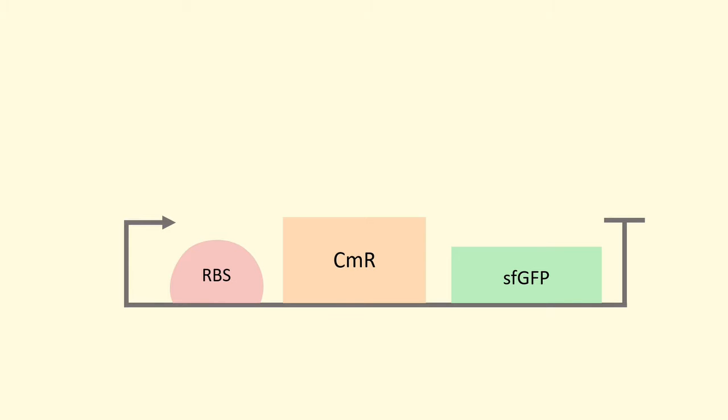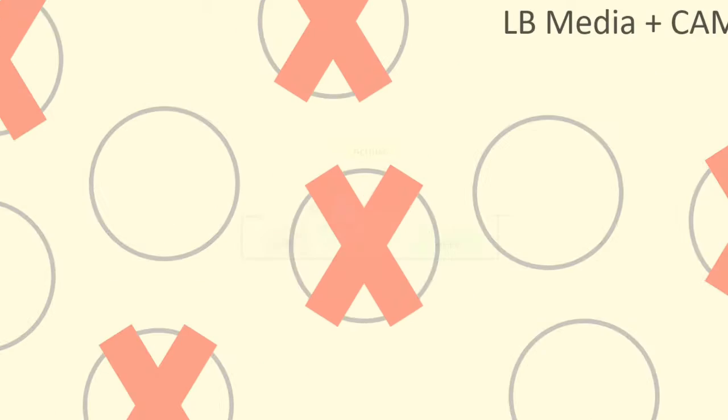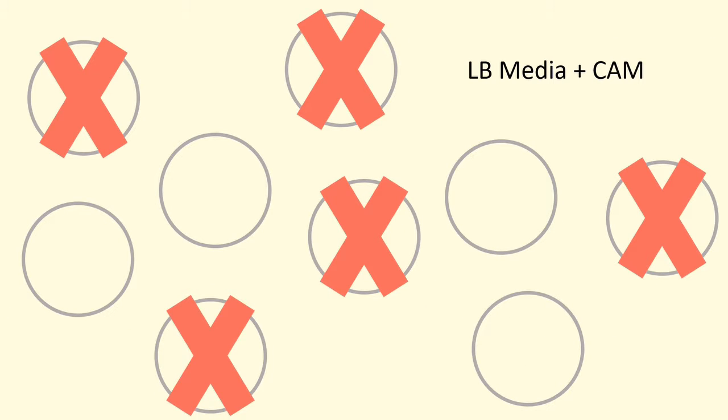However, when proteins from the second plasmid are synthesized, the sgRNA guides the Pyogenes DX-Cas9 to effectively bind to the CMR gene, blocking expression of both resistance and fluorescence. Initially, non-mutagenized AcrIIA4 protein is produced that is not evolved to effectively knock DX-Cas9 off of the DNA, and thus the CMR is not produced. Consequently, this would cause the cell to be vulnerable to the antimicrobial presence in the media, leading to its death.